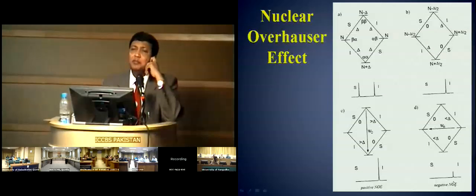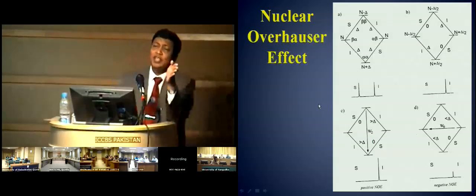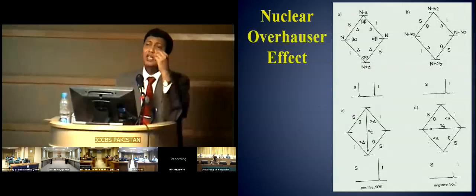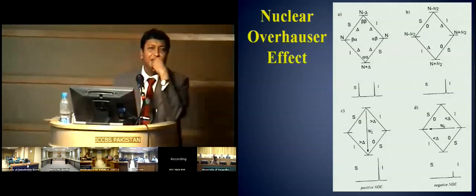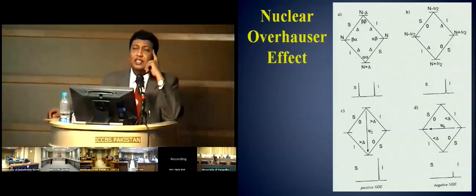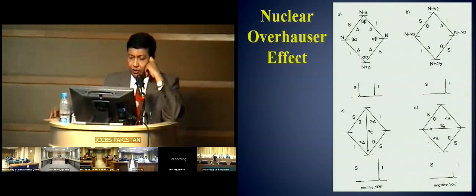But if you have somewhere in between, if your solution is viscous and non-viscous together, less viscous, not very viscous, what will happen? A nightmare, a problem. NOE is a nightmare. And I agree with Sarosh, why are we learning this, it is a nightmare. Okay, but it is a very interesting subject, and I think we'll go through this again because it is very, very important and it has lots of merit, inshallah, and we'll learn about the NOE, nuclear Overhauser effect.